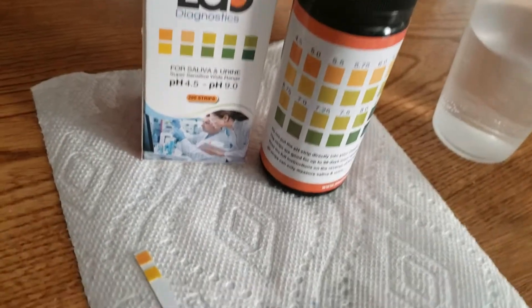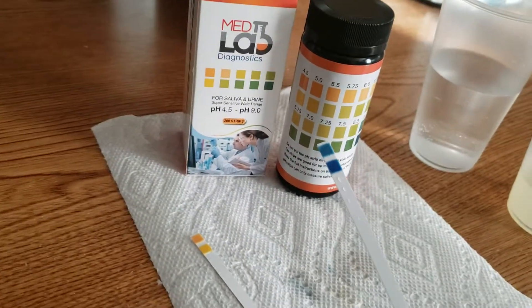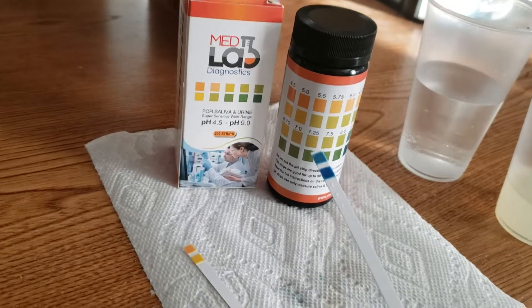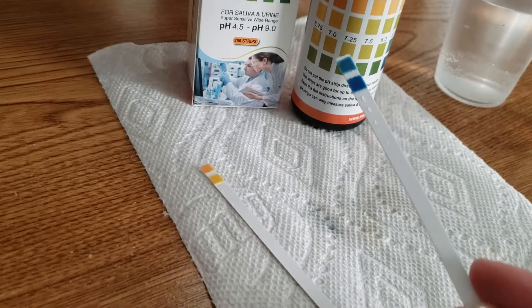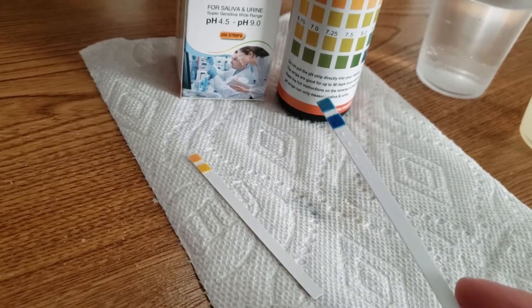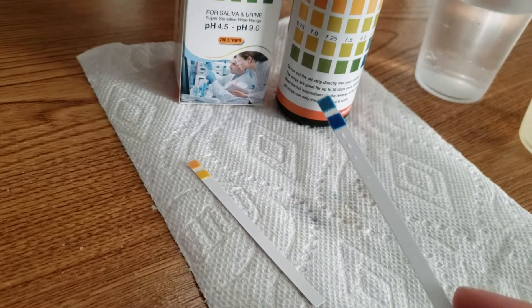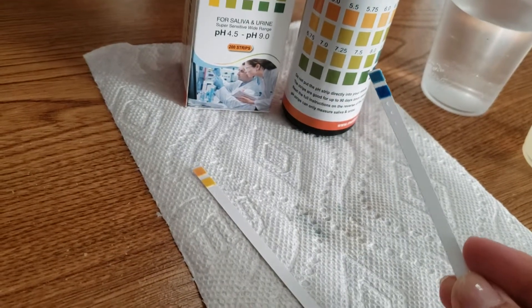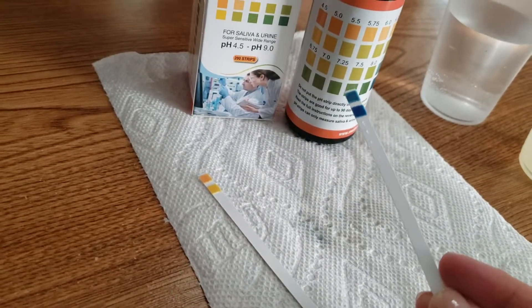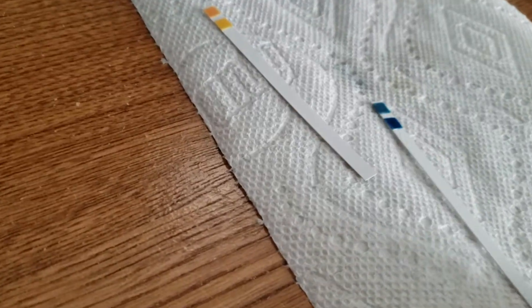When you get results that are bluish-green colors, those usually correspond to an alkaline result. We're going to do the same thing — wait a couple seconds and then compare the two pads on our strip to the two color combinations on the chart, going with the one that matches the closest.